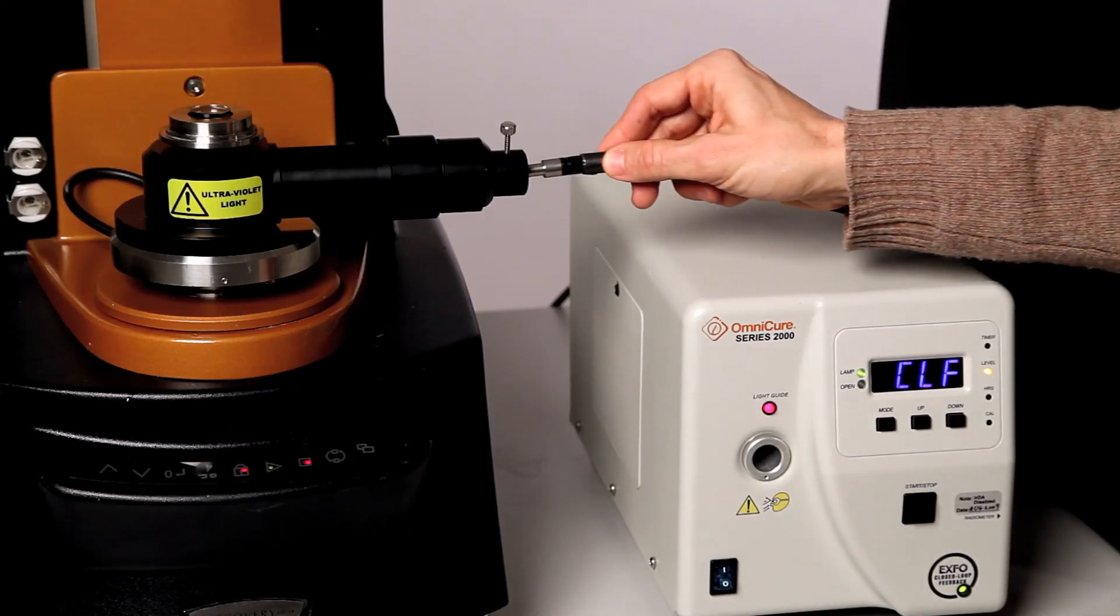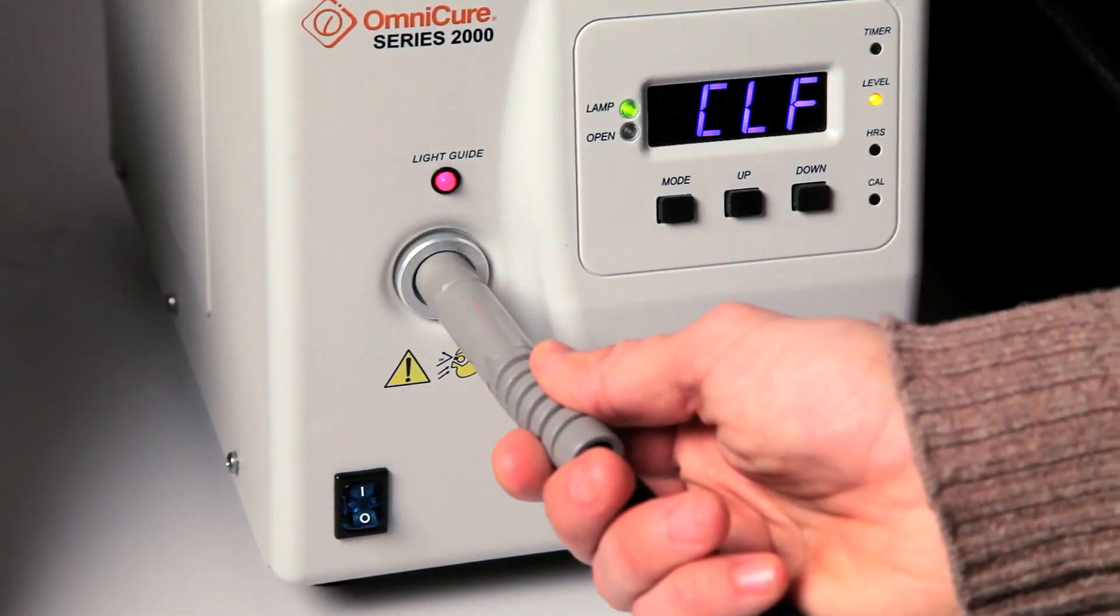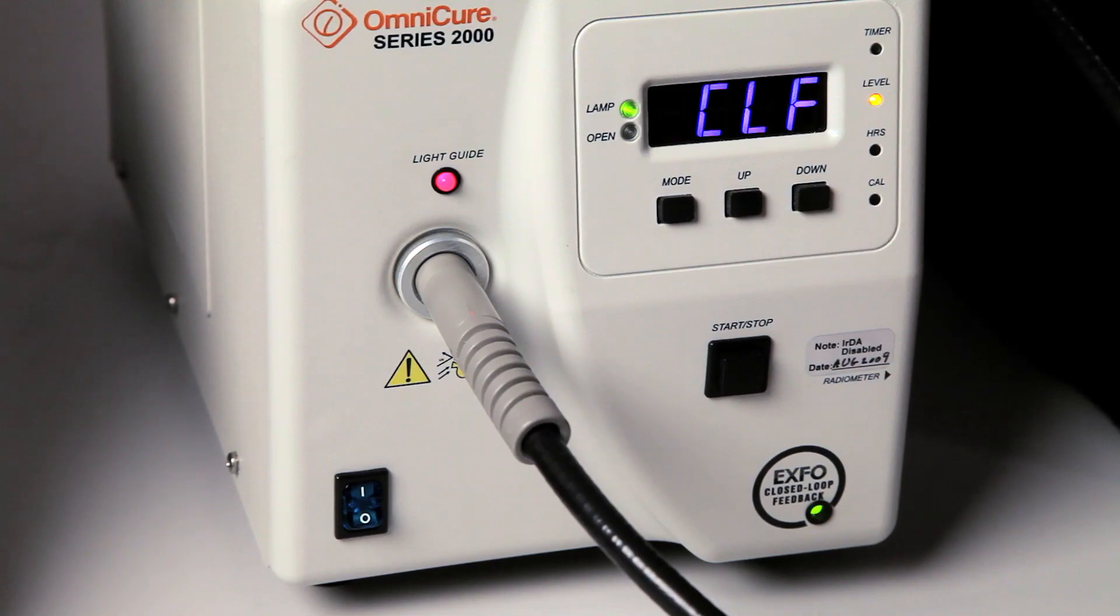With the UV lamp accessory already installed, we now can plug in the light guide. Notice that the software controls the lamp source through the event cable.